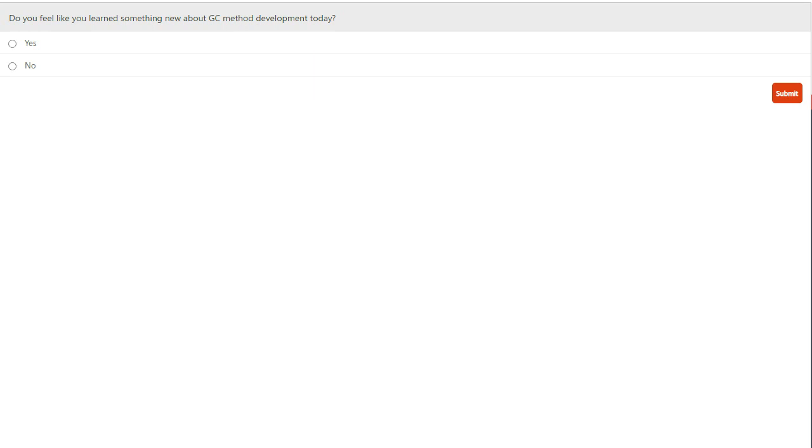Yes, if you can get a low boiling point compound that's got similar polarity, that may help in terms of dissolving more of the analytes. But I think in this scenario, your hexane will be dissolving those fatty acid methyl esters in an admirable way. So there's no issue there at all. Hexane is a good choice for injection solvent in that scenario.